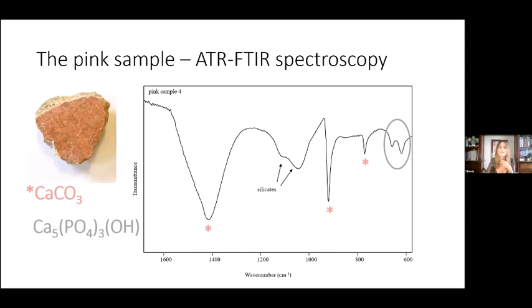According to published data, bone white as a pigment seems not so common in Roman painting found in the literature, and the performed analysis substantially confirmed the archaeological hypothesis that these samples are to be considered a unicorn among the recovered bone painting remains. Finally, it is worth underlining that only these pink samples show the presence of vanadium concurrently with phosphorus. And it was really intriguing to discover that it is not common that vanadium can be associated with bones.